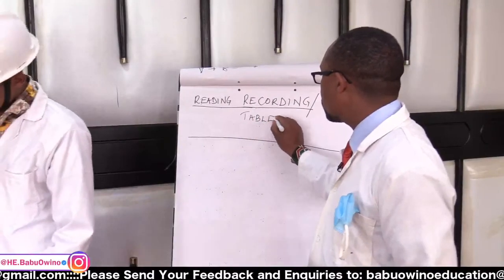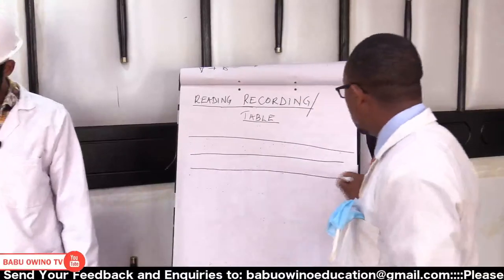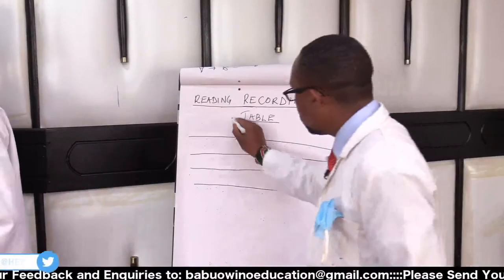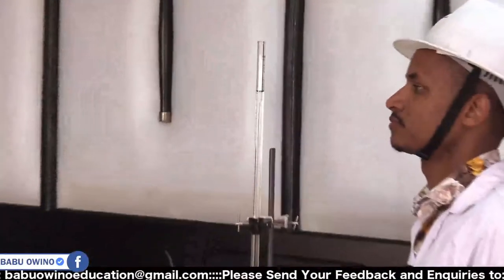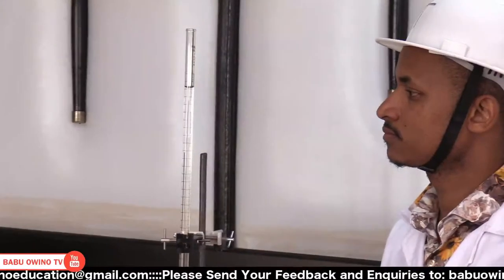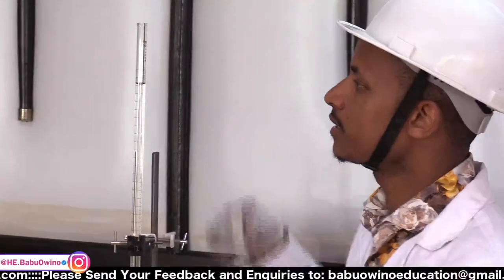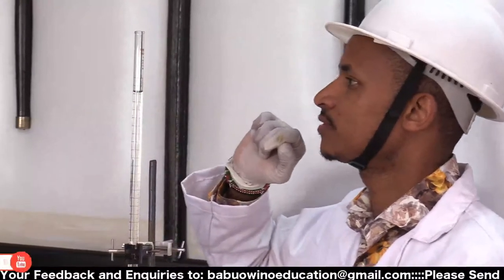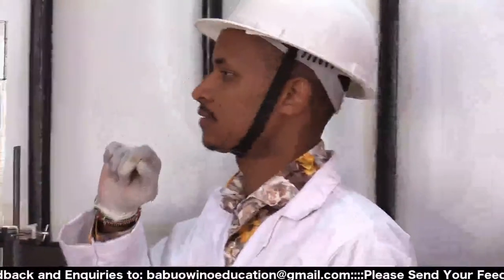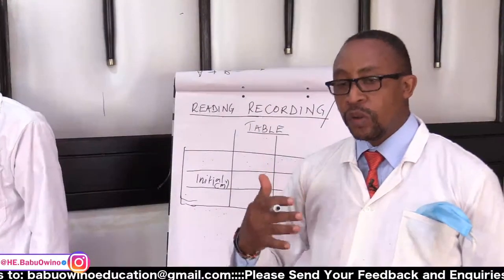We record our readings, our values, in titrations, in tabular form. In the table, from the burette, we have the reading that we are starting with. That is the initial burette reading in centimeters cubic. And read for me. Here we have 1.8 ml.